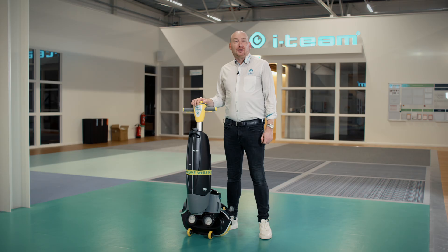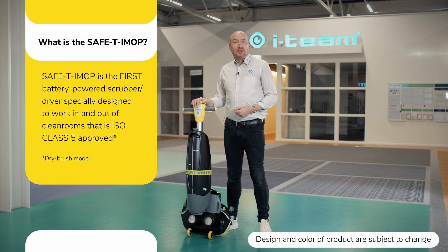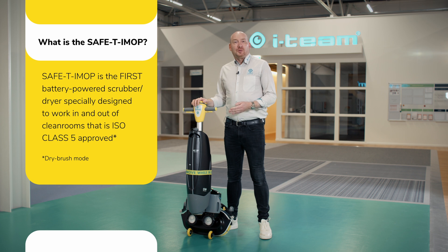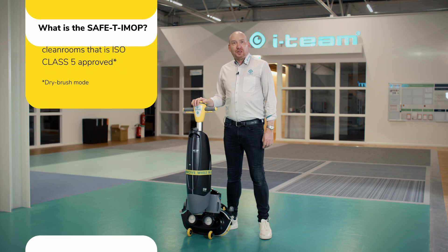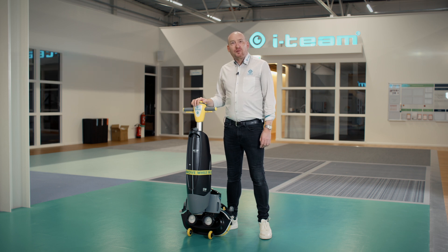The Safety IMOP is the first battery-powered scrubber dryer designed for use both inside and outside of a cleanroom environment. It's been certified by the Swiss company SGS to ISO 14644 standards, meaning it's approved for ISO class 5 in a dry brush condition and ISO class 6 in a wet brush condition. Now let's take a look at some of the special features that make the Safety IMOP the perfect cleaning solution for your clean rooms.